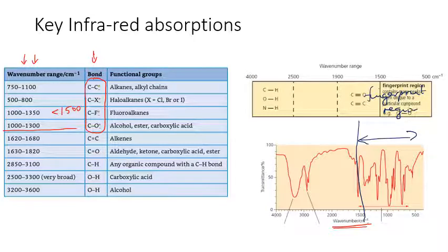As you can see, it gets pretty hectic, and it's very difficult to read because you've got lots of different bonds all absorbing very similar radiations. So usually we leave it to a computer to look at that fingerprint region. They can do it much more precisely and accurately than we can by eyeballing it. So in exam questions you're not generally required to read any data from the fingerprint region. We're more concerned in exam questions with this part of the spectrum here, 1500 and above.